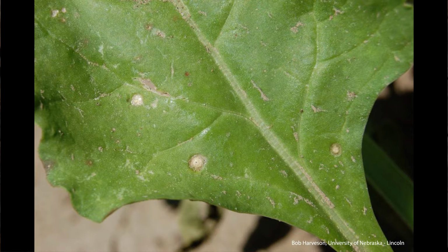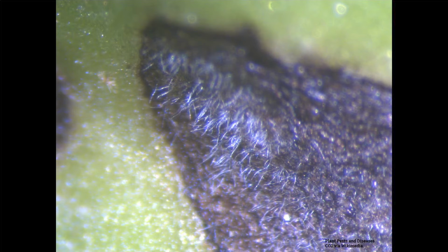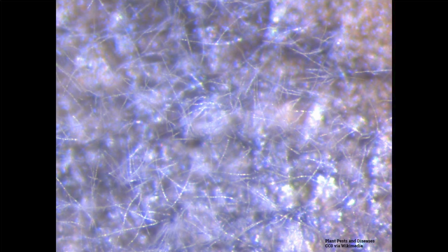Well, it's sort of an ash gray, a lighter gray. They're oval to circular, and then they can coalesce and really kill a large part of a leaf. They nearly always have some sort of a dark halo, dark brown to purple, that sort of thing. Mm-hmm. What you're looking for with the hand lens is clear. Well, they're clear and they look kind of like cobwebs.